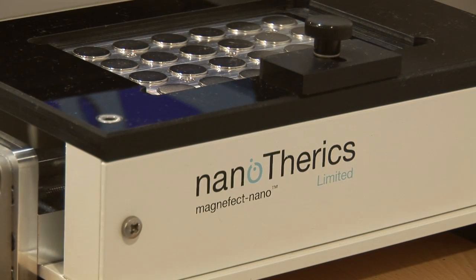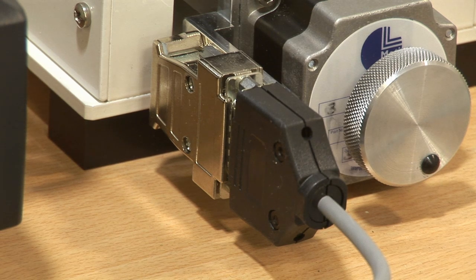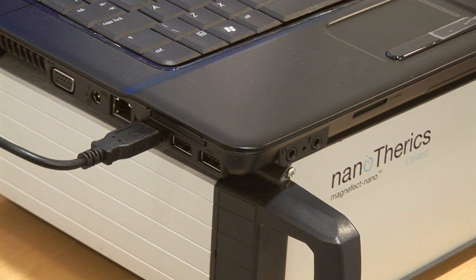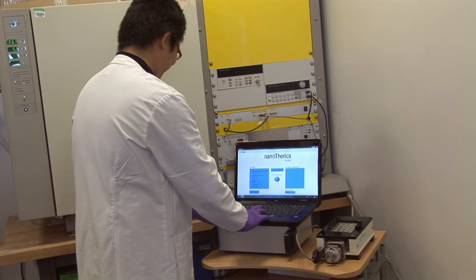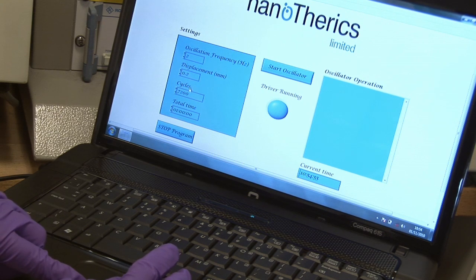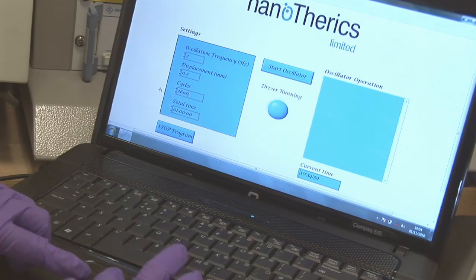Whilst the DNA nanoparticles are incubating, the Magnafect Nano is prepared for use as follows. Connect the power supply and data cables. Turn on the power. Start the Nanofect software. Select frequency, displacement and length of experiment. These are all user-definable to enable optimization for more difficult cell types.